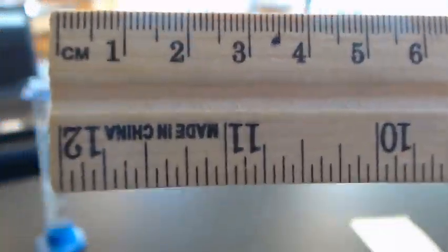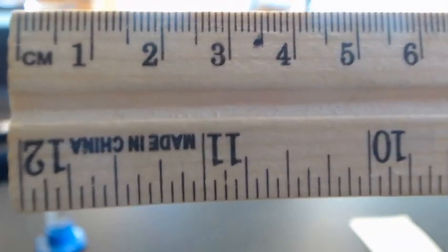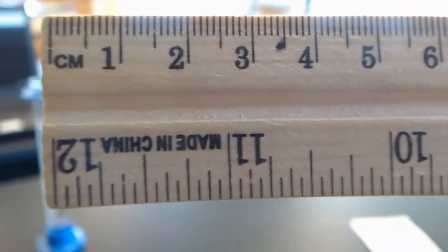And it's actually very easy. It just requires you to get really up close and personal with the measuring tool that you're using. So it's actually very easy. Let's get to it. All right. So when you are measuring, whether it's with a ruler, a graduated cylinder, a thermometer, anything, you need to focus on a few things.